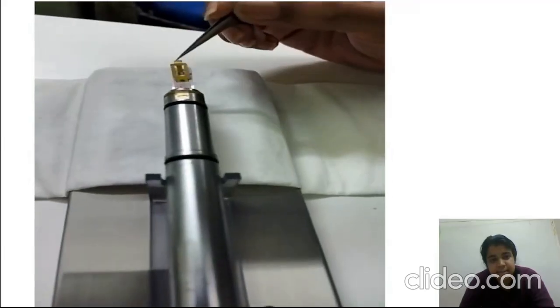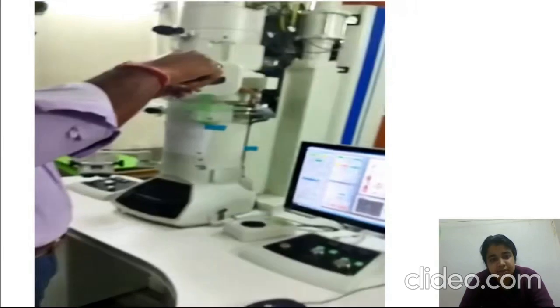And then we have to insert the sample holder.